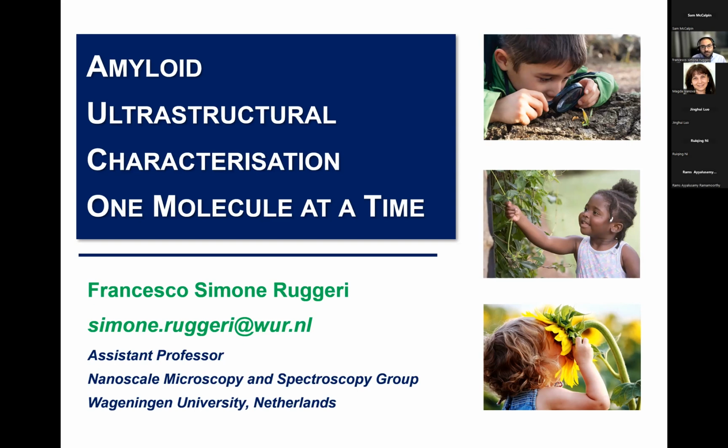Overall, I would like to show you a journey of how we moved from just trying to visualize amyloid aggregates at a very different scale than you've seen in the previous talk, because now it goes towards a single molecule scale. And from visualizing them to also being able to touch and mechanically probe them, as well as to taste them, and so to probe their chemical properties to understand how they are involved in the biomolecular processes related to disease.